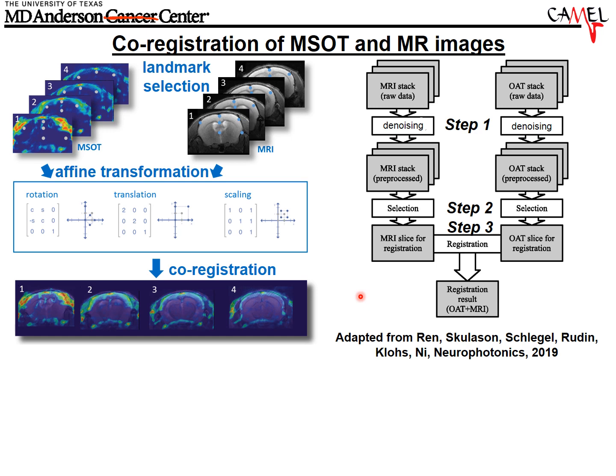However, there are two important points that I want to make about this slide. The first is you got to curate your data. You got to make sure that your data is good quality before you go through some of these more advanced processes. And again, I like to call that data processing or image processing before you get to the true analysis step. And so in this case, they were denoising their data, very standard processing method. Then they can finally go through their more advanced analysis method to do the co-registration of the images. So it's a two-step or perhaps even a three-step process, right? Think of it as processing followed by analysis.